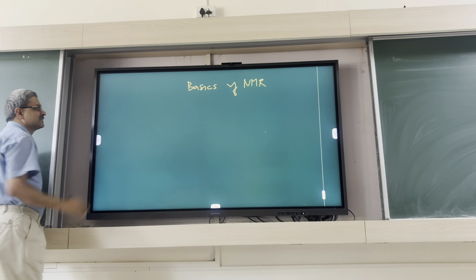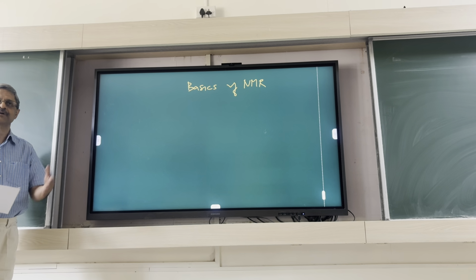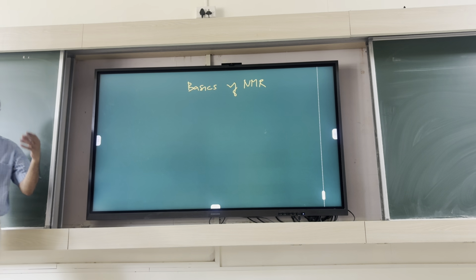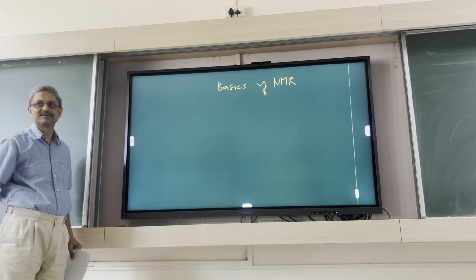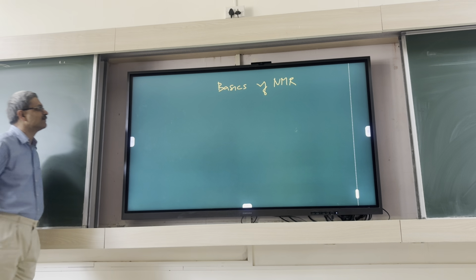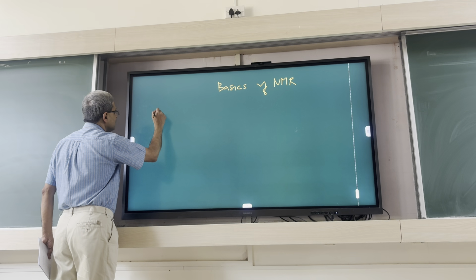So we are obviously interested in nuclei which have a magnetic moment. You're all aware nuclei contain protons, neutrons. Each has a magnetic moment. Overall, they have some spin angular momentum, and in those cases, you can do this resonance experiment. So, just some initial notations, right?